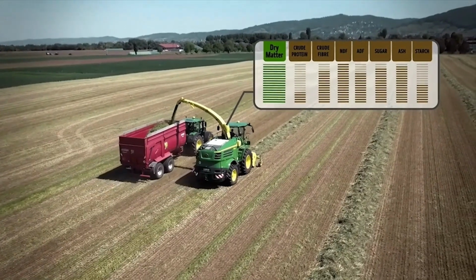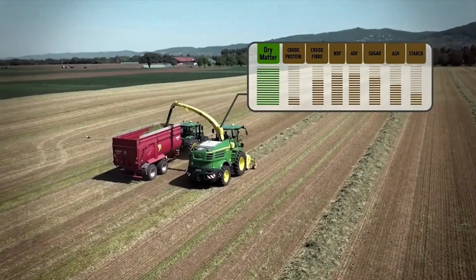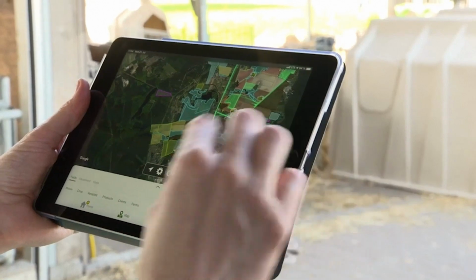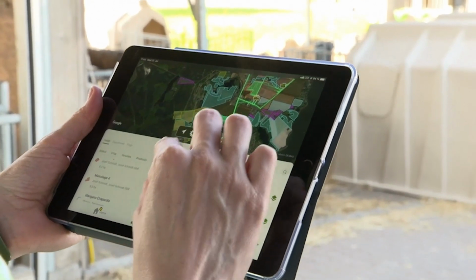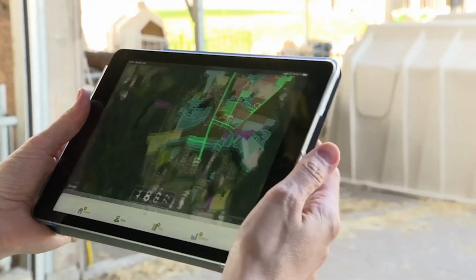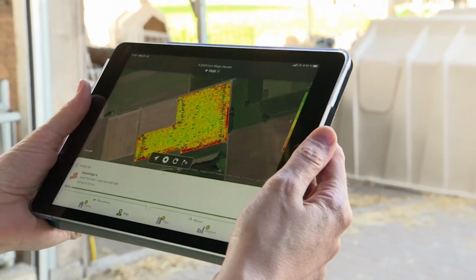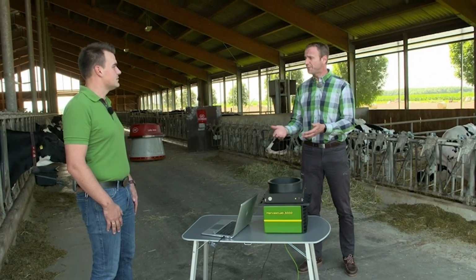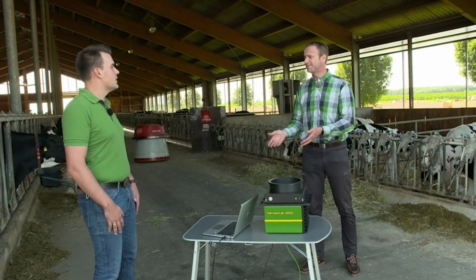Marius, how is all this being used in practice by customers in the livestock production system? Keeping with the forage harvester, I can measure ingredients there during harvesting and specifically document subplots. And then everything is digitally documented in the display and automatically transferred to the operations center, where it's assigned to the correct field. Based on this, I can then make better agronomic decisions, especially when it comes to fertilization.